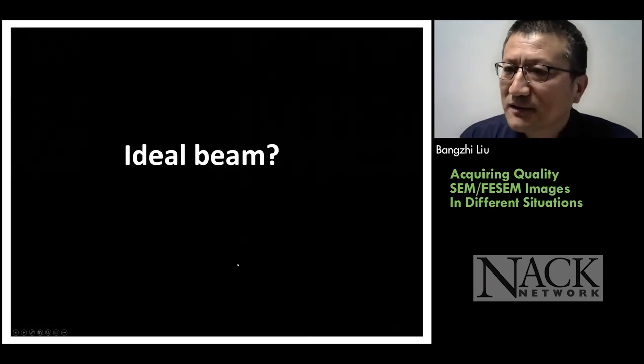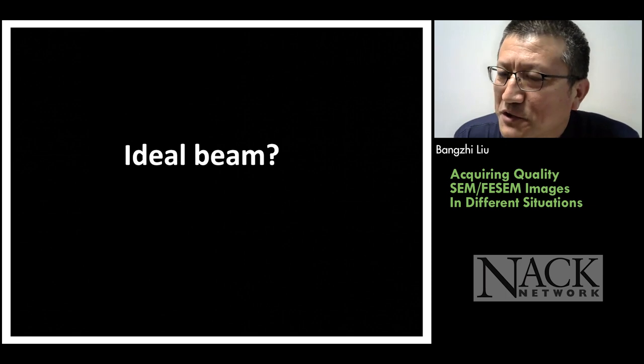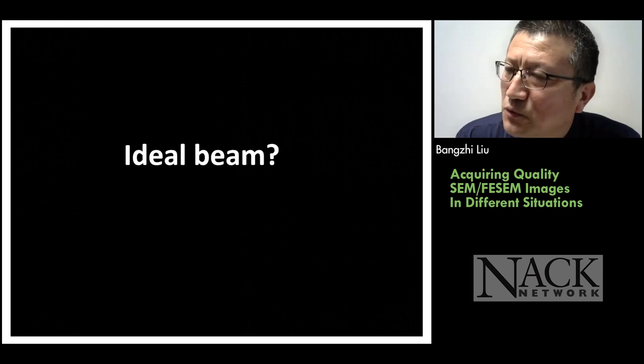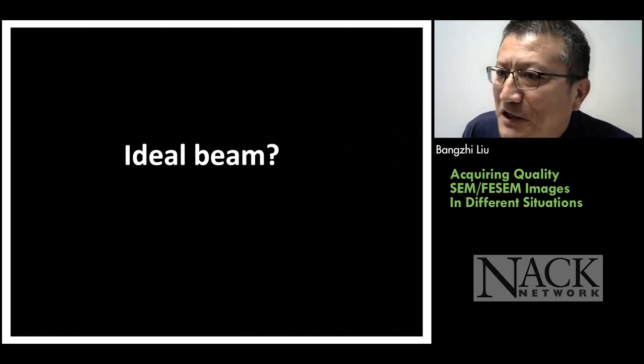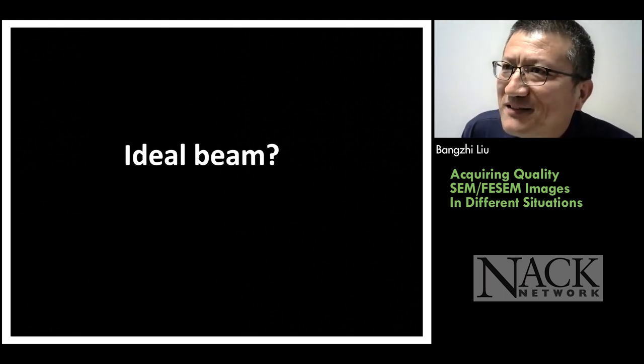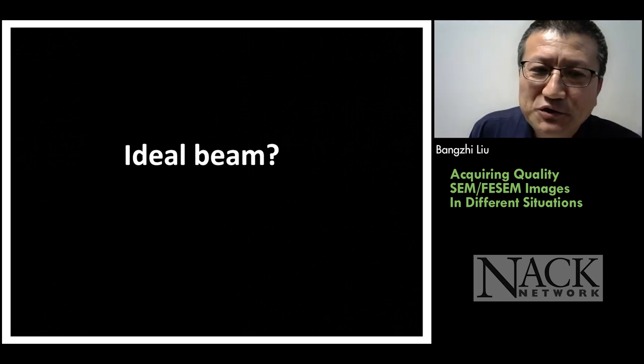Now I'm going to ask you one question. What do you require to make the beam ideal? How can you make sure the beam is ideal? What kind of beam do you want? One problem is that the actual beam is hard to imagine and hard to visualize. We cannot really see the beam.